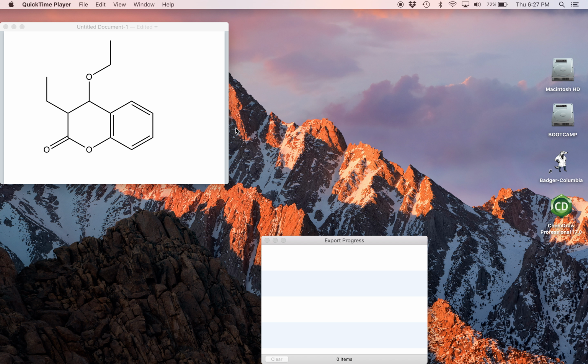Hello. First of all, thanks for all the great questions in class today. I think one question that came up often was people were unclear on exactly what the workflow actually looks like when you go from start to finish on a crystal structure, like in the problem set. So I'd like to go through an example.